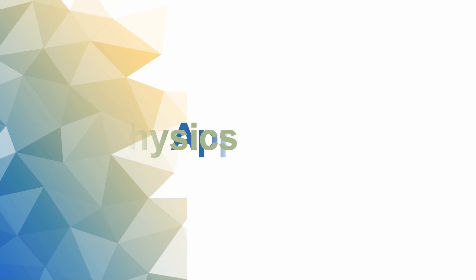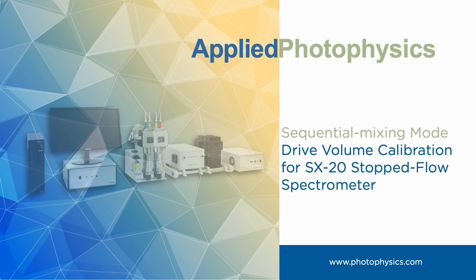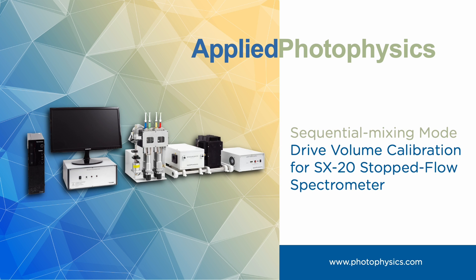Hello, this is Pavel Rizzov, I'm an application scientist with Applied Photophysics. In this video, I will demonstrate how to adjust the drive volume for SX20 stop-flow spectrometer in a sequential mixing mode.